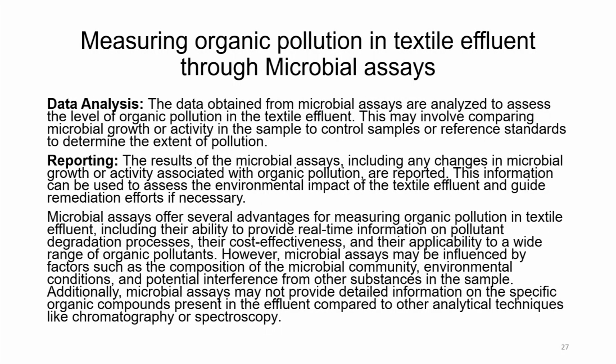Data analysis. Data obtained from microbial assay are analyzed to assess the level of organic pollution in the textile effluent. This may involve comparing microbial growth or activity in the sample to control samples or reference standards to determine the extent of pollution. So, always there will be a reference or a control sample against which the microbial assay result of the pollutant is compared.